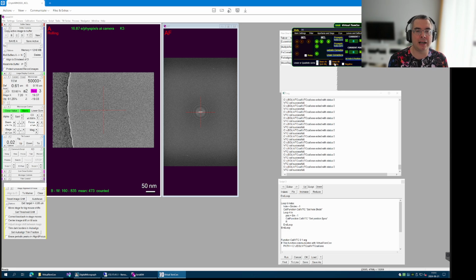As you can see, we add tons of functions here. We also test new things. So this is the platform that we want to move forward. Python and JAFIS are obsolete. They are not maintained, and we no longer fix any bugs there, simply because we can't have 2 platforms doing the same thing. And Python was deprecated simply because it's quite difficult to install, challenging to maintain, whereby here we provide you with an executable that just runs.